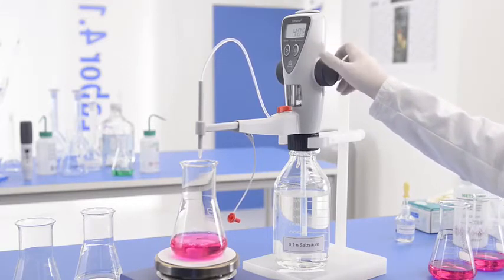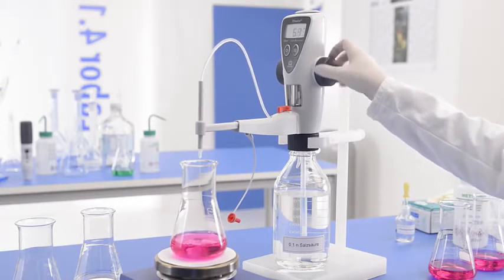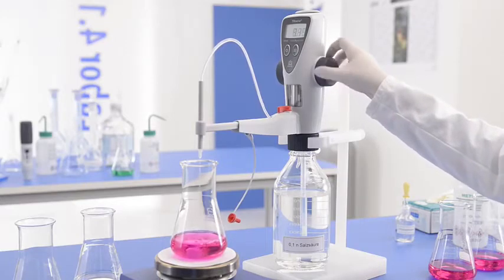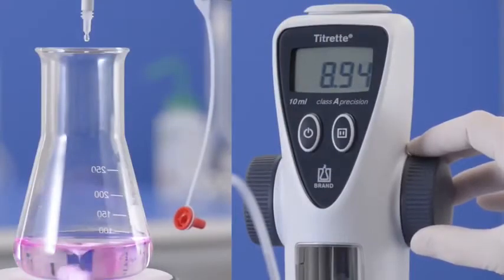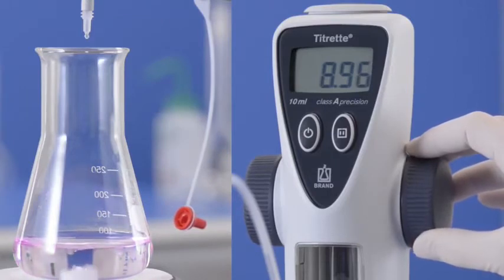If the approximate concentration is known, titration can proceed quickly until shortly before the end point. Then add the standard solution, drop by drop, until the color change.